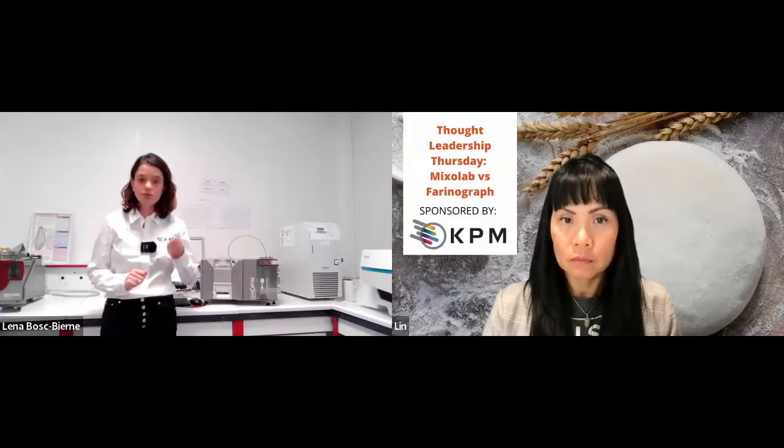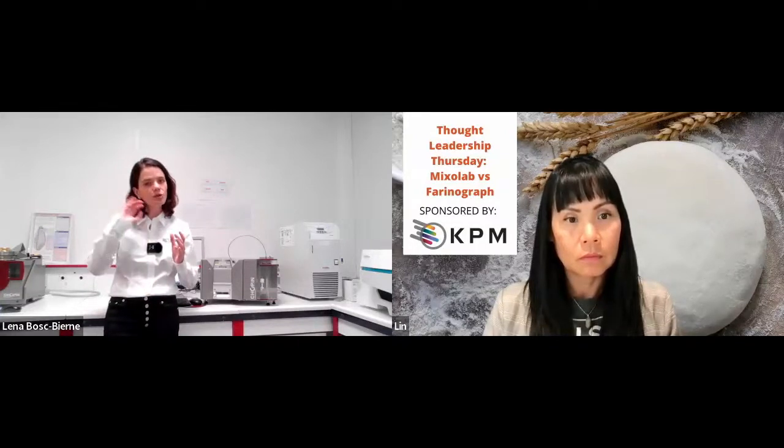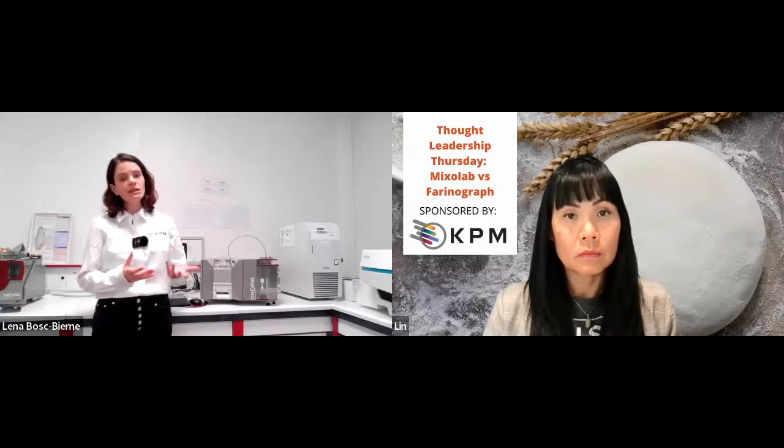But this is where the Mixolab is unique, is that it will allow to go further. Instead of stopping here, at the mixing information, then the temperature starts increasing, and this gives access to a lot more information. For instance, how the protein network will resist to temperature, which is directly related to the bread volume in the end. Then as from a certain temperature, the starch will start gelatinizing, which gives information about the crumb structure in the end. Then there is a step where the temperature remains constant, but very high temperature, 90 degrees Celsius, which allows to see the amylasic activity, for instance. And finally, the temperature cools down, and this gives us an idea of the starch retrogradation.